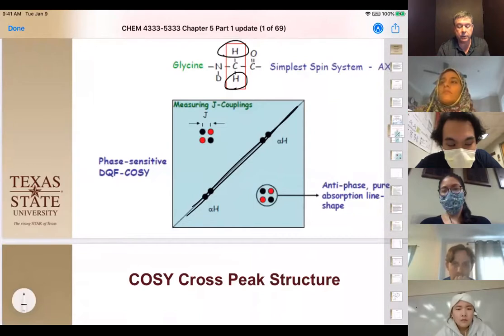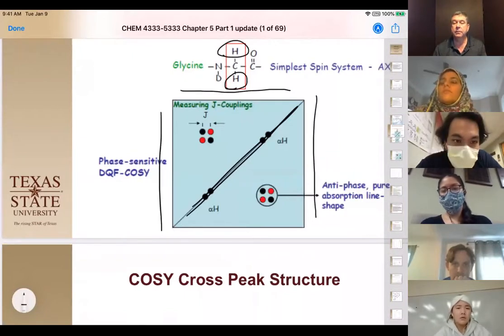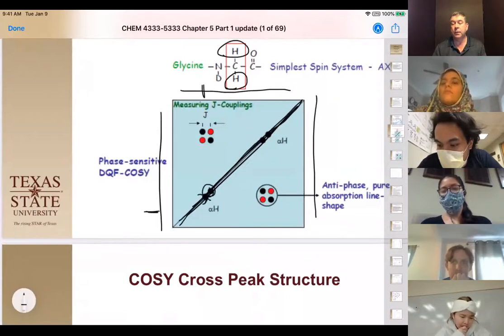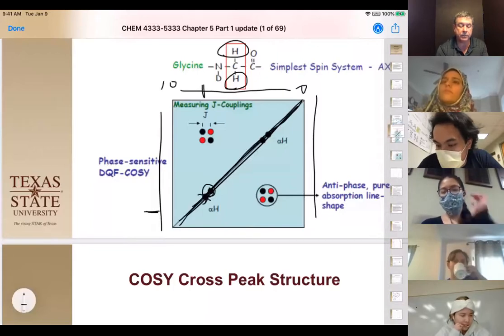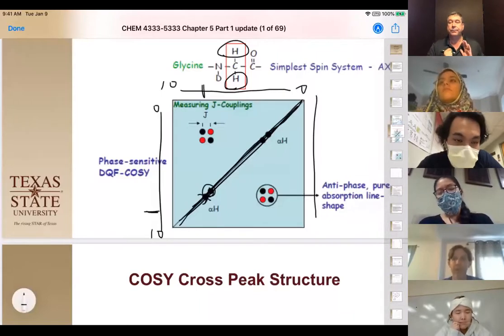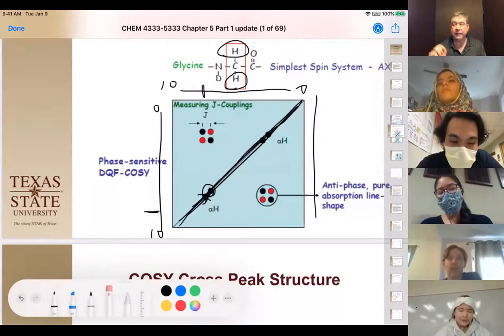So the top left side of the graph, your typical NMR spectrum, is correct. You would usually have the spectrum at the top and at one of the sides, and they should correlate to a diagonal line showing you that peak A here is going to be peak A here, because they're on the lines. They're typically done in the same way, from 0 to 10 and from 0 to 10, so that we get that diagonal line. Did that answer your question?